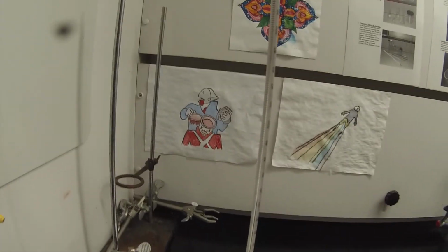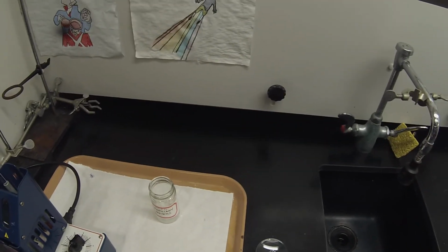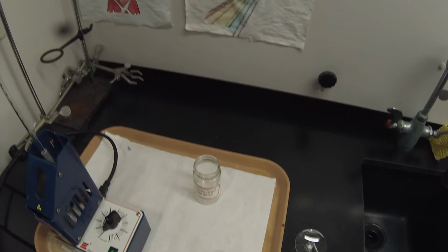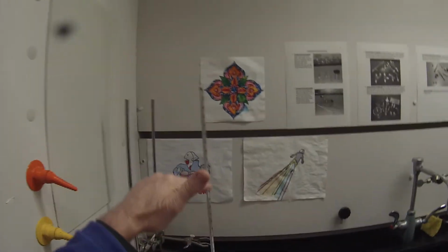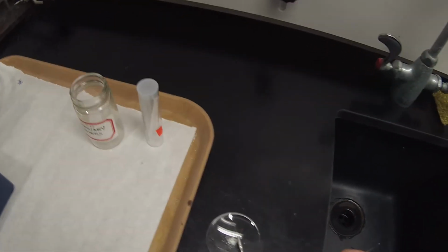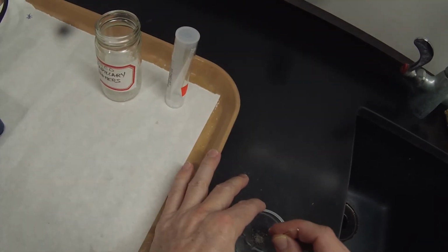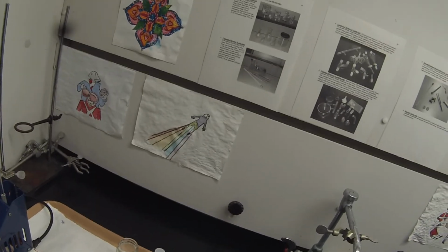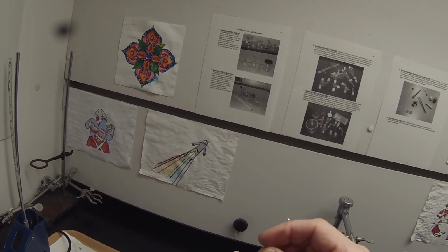I'm going to turn this back off now that we know that we're going to have a pretty low melting point. I'll turn that off and let it cool. And prepare a new sample. If I hadn't gone over to mess with the GCMS spec, we would have had the one that melts at 180. And we would have been watching it do nothing. Because that's Murphy's law. But that's good, because now we have a pretty good idea how long that's going to need to go for.